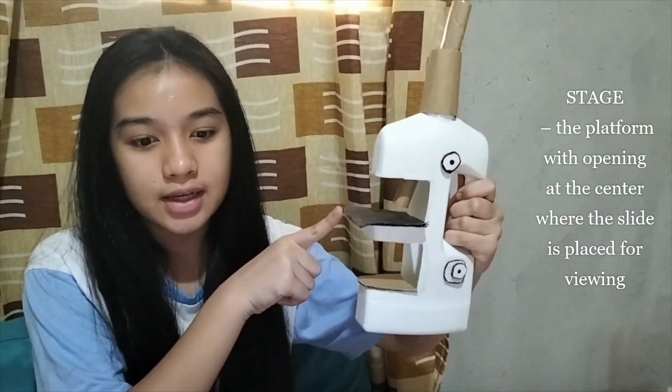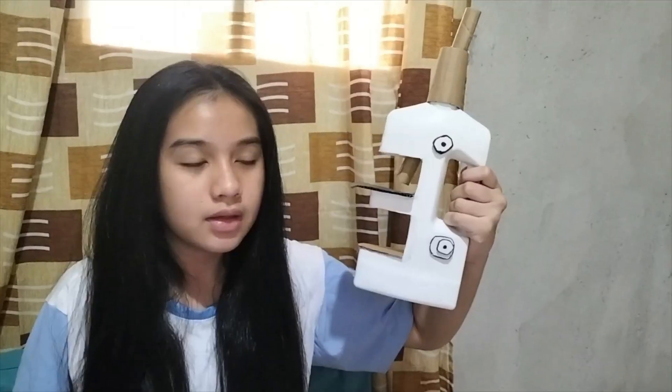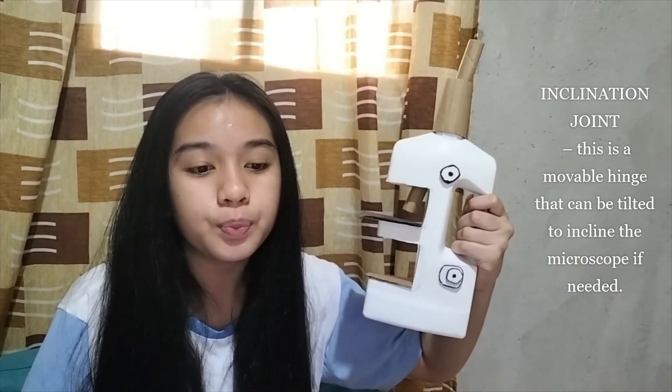This one here is called the stage — the platform with an opening at the center where the slide is placed for viewing. This is the inclination joint, a movable hinge that can be tilted to incline the microscope if needed.